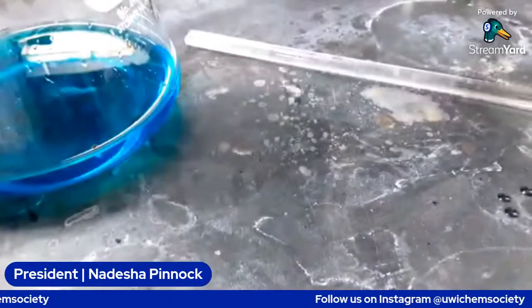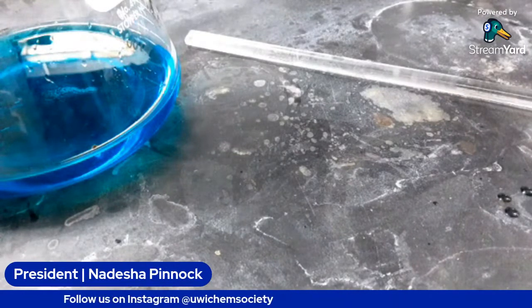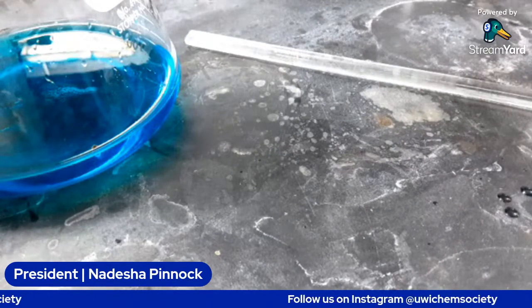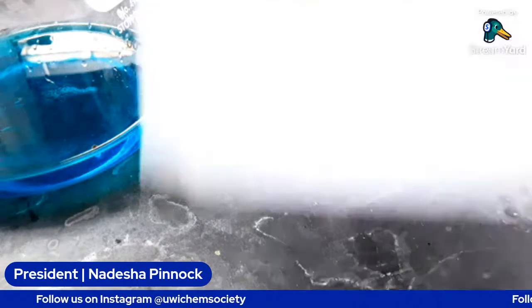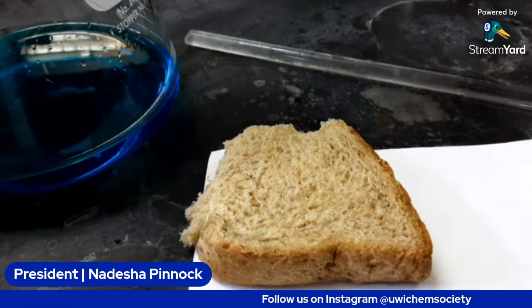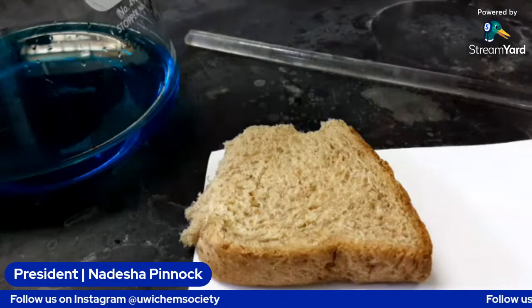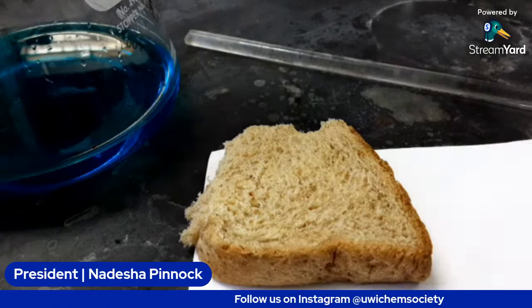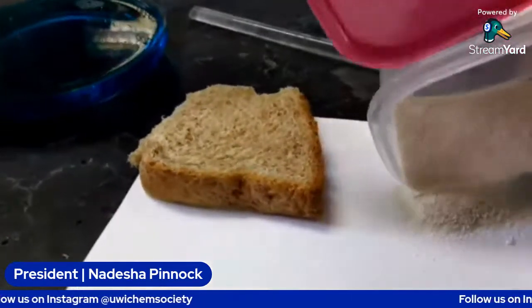So for our samples for the starch test, we're going to use bread, and some cereal, and rice. This is the cereal.